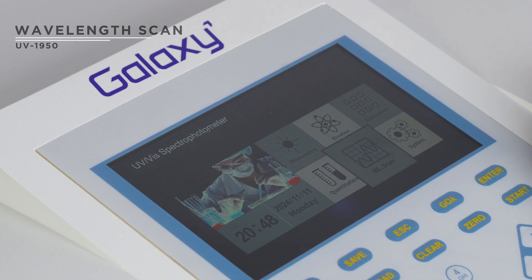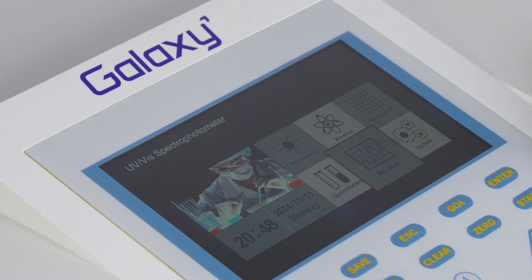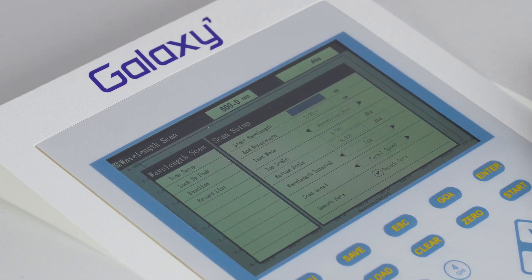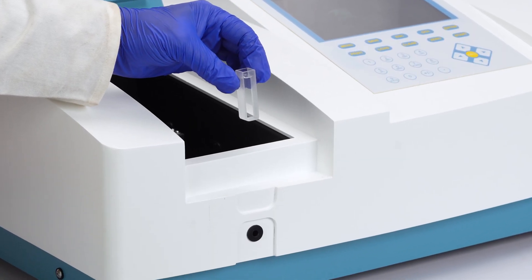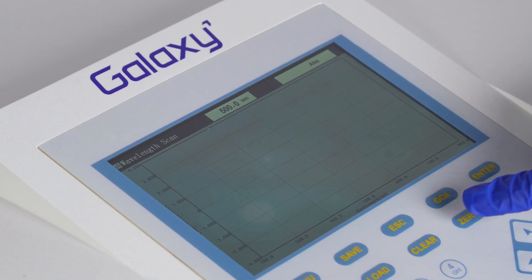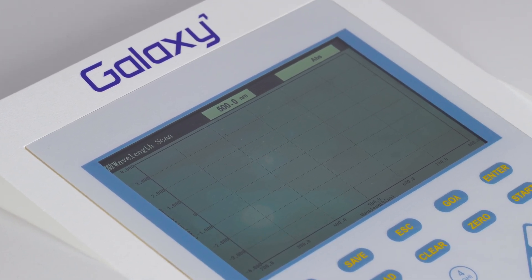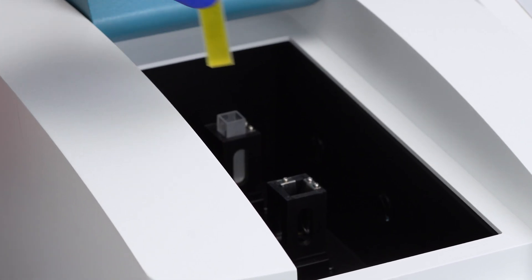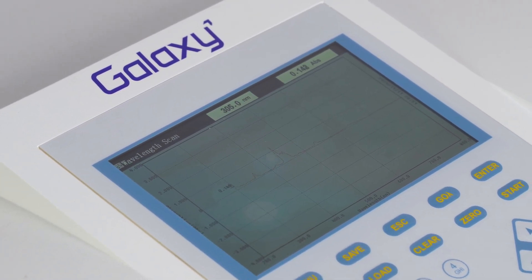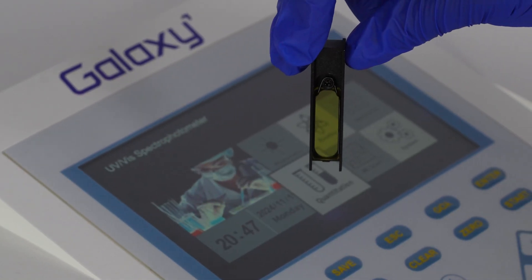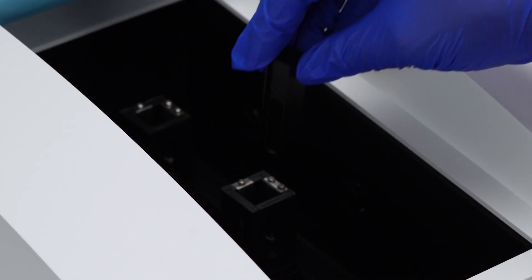Wavelength scanning measures unknown sample wavelengths. Input the start and end wavelengths, interval and scan speed. Place a blank solution and press zero to create a baseline. Insert the sample, then press start to begin scanning. Use a Holmium filter to check wavelength accuracy if needed.